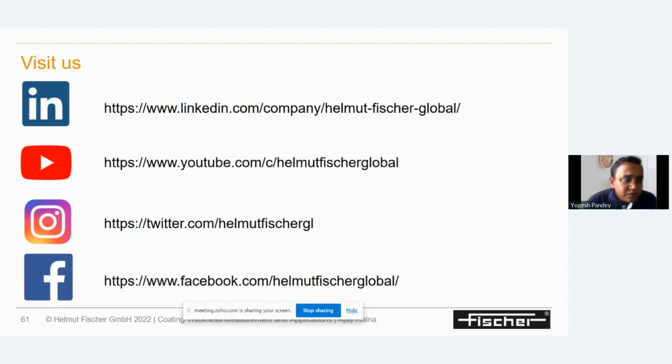So the first question comes from Mr. Vipul Sawant: what will be the use of this machine for in-service underground pipeline when exposed? I think Ajay sir, you could better answer this. I think he wants to convey that he wants to inspect the service-related thing for the underground pipeline. So I think it is not related to this X-ray machine, because it is a laboratory-based machine kept as a benchtop model, not for on-site application. So definitely a big no for this kind of application.